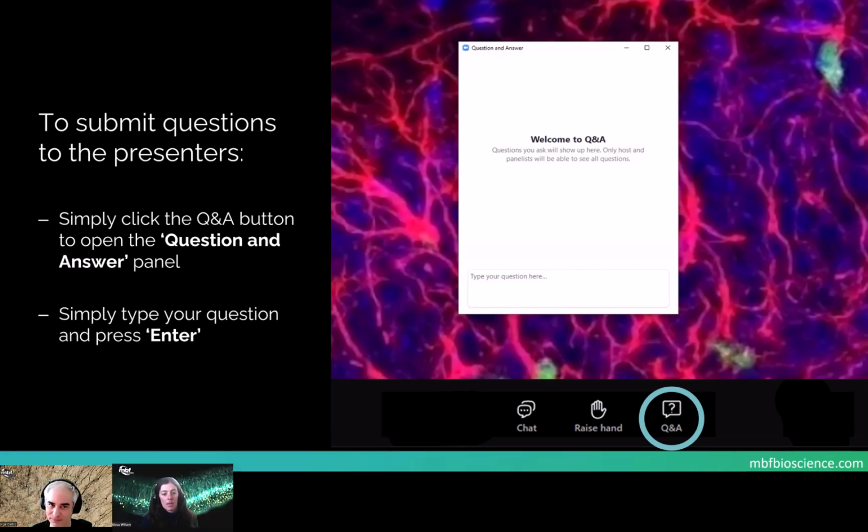For the contours, that is something that would actually be done on your acquire system. So whether you're utilizing an MBF piece of software, which would be Stereo Investigator, or different software, your contours would be done there. Your acquires would also be done there. And then that data would be brought into Stereo Investigator AI to then set up the probe runs and do the runs. So that is something that actually is not done within this software, because all of the acquires are being done in a different piece of software. And that is definitely something that we can go over if you're interested in a one-on-one demo and how to do those contours and acquires on whatever system that you currently have. We could go into depth on for your individual needs.